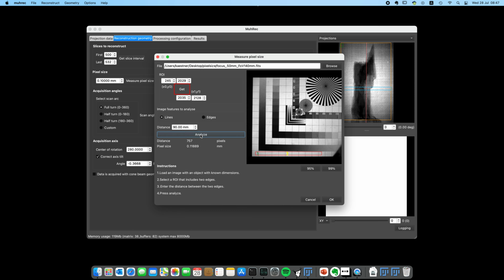And well, in this case, these objects were not that precise apparently, so we have to get a little bit better, sharper lines. Let's take those here. Now we have 4 boxes, and then it didn't find it either. So you can see that the line analysis requires much sharper objects.